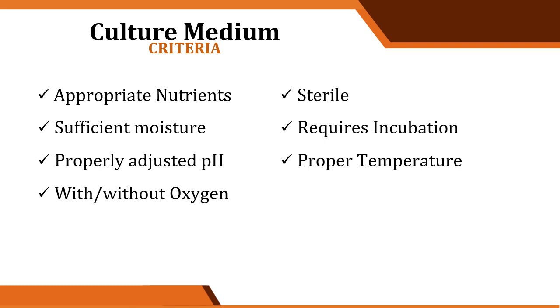And then, it requires incubation at a proper temperature. So, no matter how good you have prepared the culture medium, sterile nga siya, merong appropriate moisture, pH, and whatever. Kung hindi naman siya incubate ng ayos, hindi rin tutubo si bacteria. Okay? So, it requires incubation at a proper temperature.